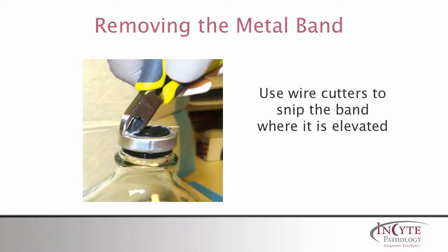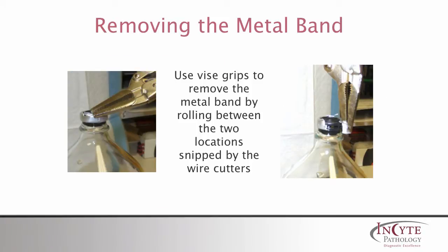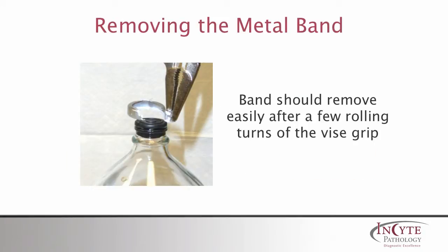Now use the wire cutters to snip where you elevated the band with the screwdriver blade. The vise grips are needed to remove the metal band by grabbing the two locations snipped by the wire cutters. Carefully turn the vise grips so that the metal band is wrapped around the nose of the grips — the effect is similar to opening a sardine can with its can-opening key ring.